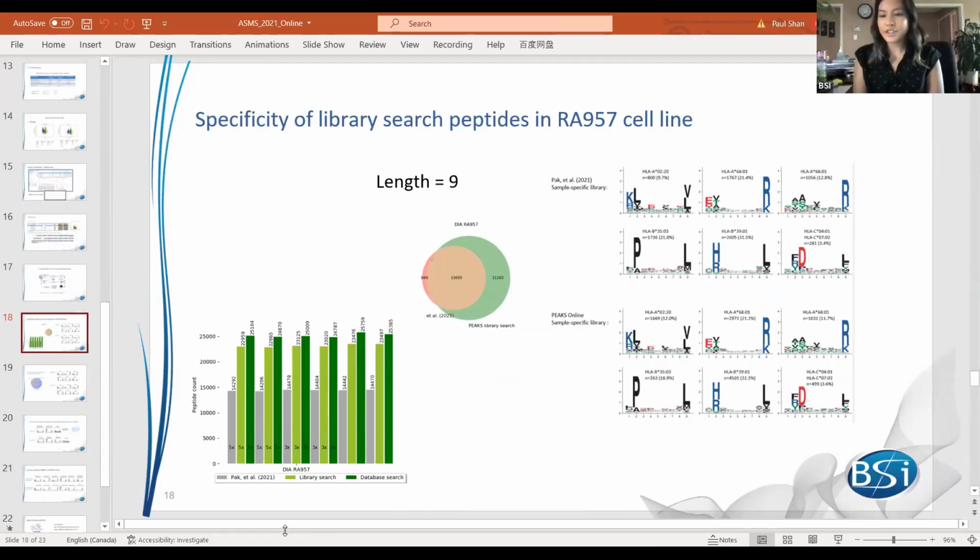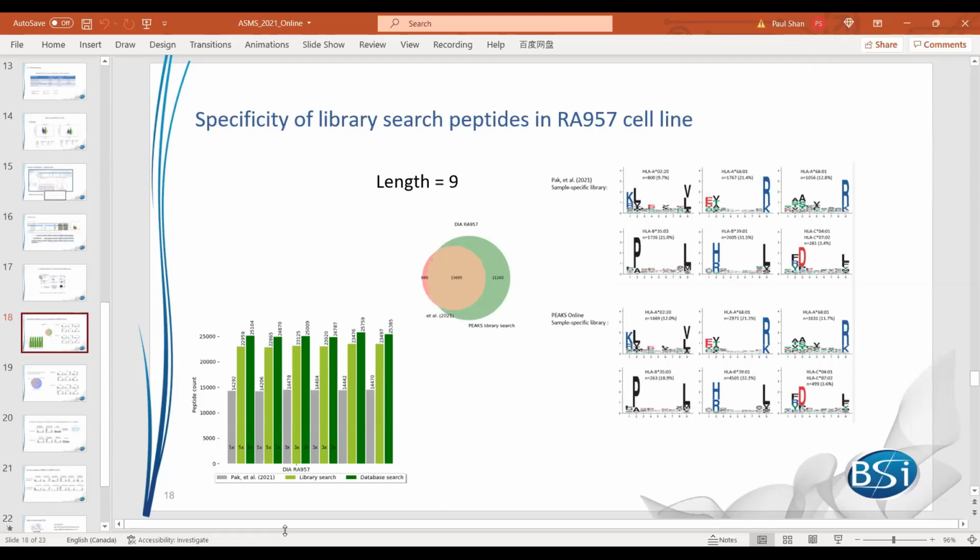Great. And actually there's one more question. What is the accuracy of identifying peptides with PTMs such as citrullination? I think right now DIA with deep learning methods in DIA data analysis still has some challenges for PTM analysis. Surely, for common modifications, we can train them.